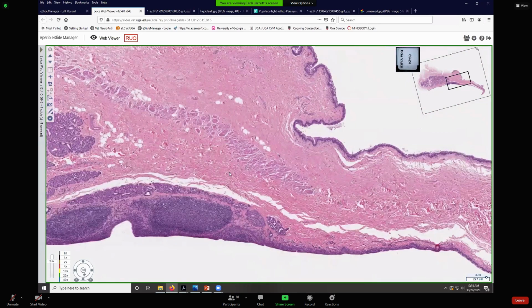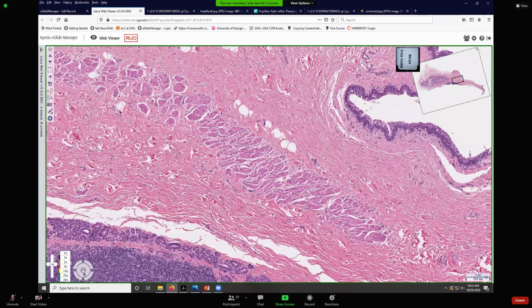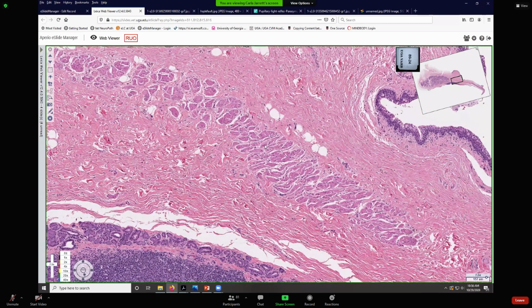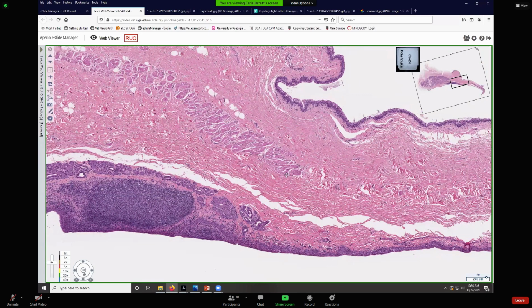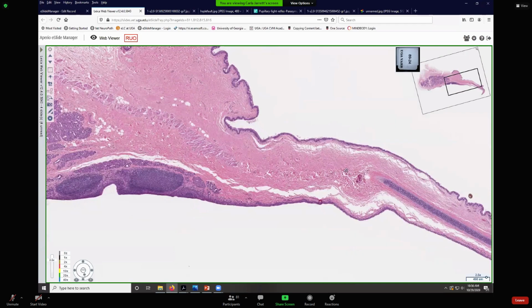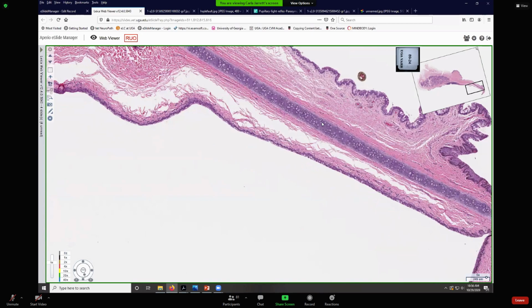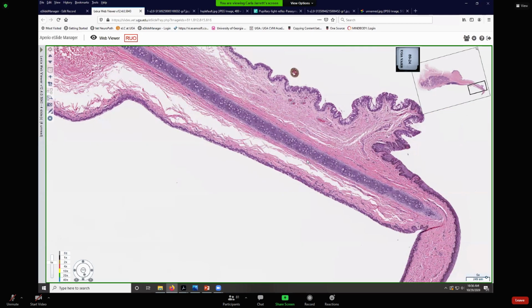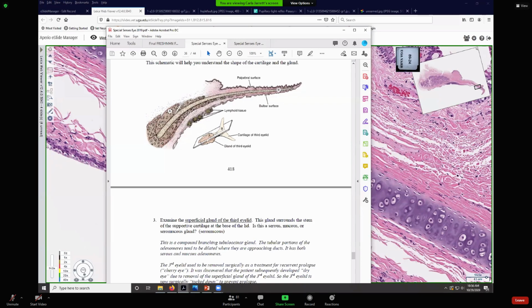It is made up of dense collagen. It has smooth muscle in it that is under sympathetic control to maintain tone in the third eyelid. And you'll learn more about the sympathetic innervation of smooth muscle in the periorbita, the little stocking net that surrounds the globe and all the adnexa. It has a supportive framework made out of cartilage, usually hyaline, but can be elastic, but again, usually hyaline, and that's usually T-shaped, that cartilaginous framework.